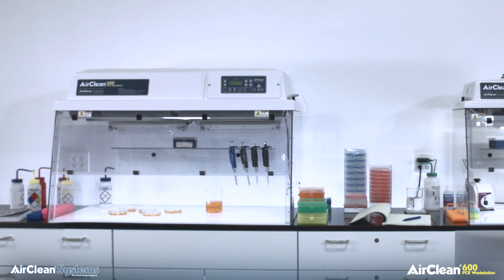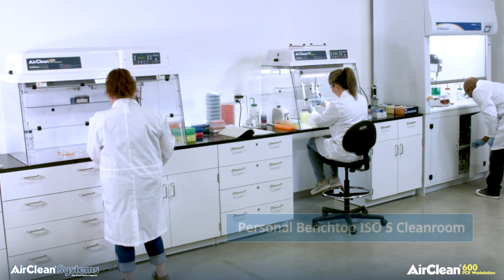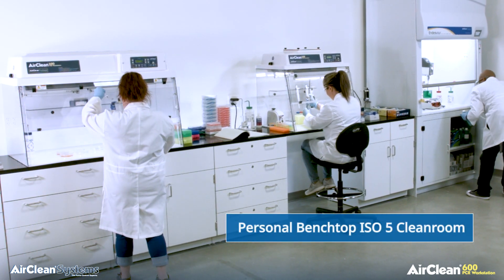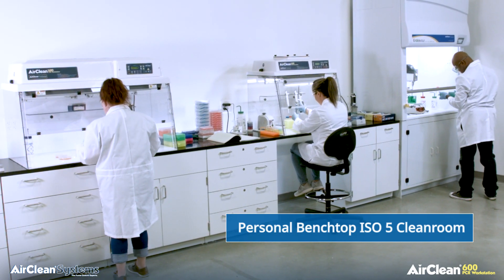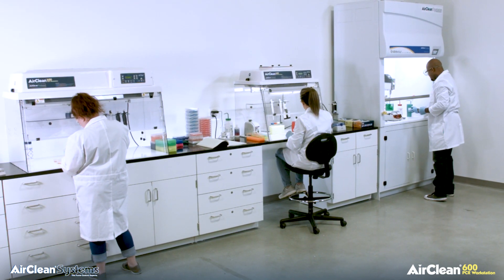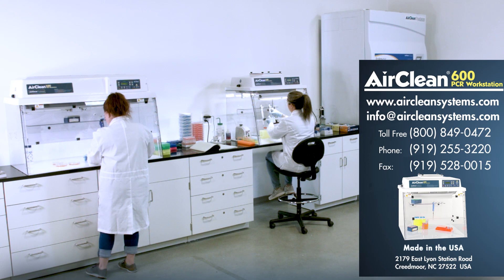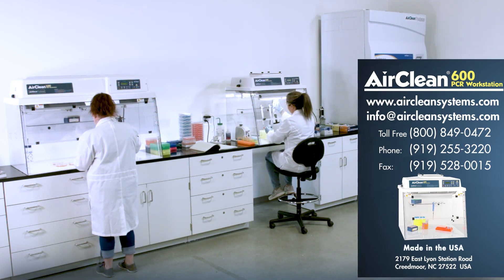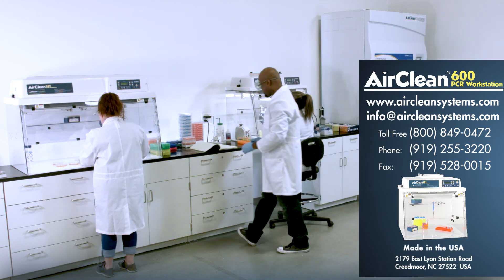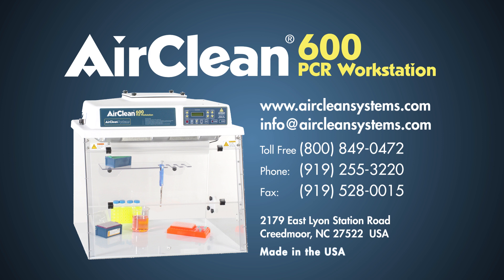AirClean Systems combination PCR workstations allow the operator to create a personal mini clean room on the laboratory bench. By incorporating an AirClean Systems combination PCR workstation into your application, you will improve your odds and reduce the amount of reagents required to achieve your desired result the first time. AirClean Systems combination PCR workstations are UL, CSA and CE certified. AirClean Systems — leading the way in contamination-free workstations for today's and tomorrow's life science research. Contact AirClean Systems for more information, and we are confident the workstation will meet and exceed your application requirements.